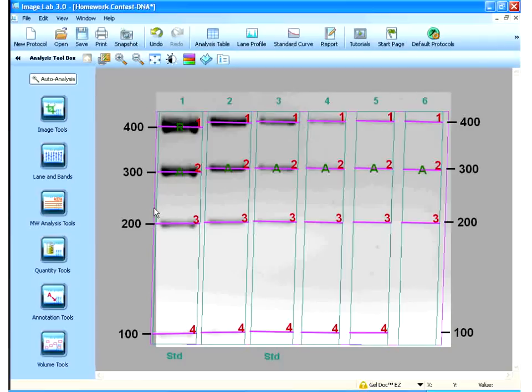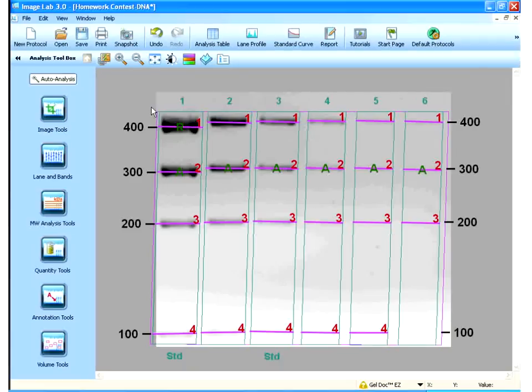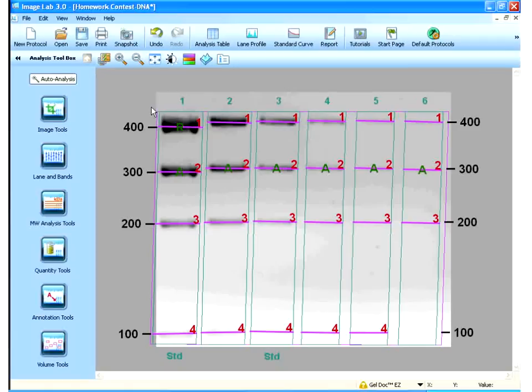So, I hope that was useful. Also, a very nice set of tools in Image Lab to allow you to do all the type of densitometry work that you would ever need to do for either gels or Western blots. Using the Chemidoc XRS, our Versadoc instruments, the 5000 and the 4000. Also, allows you to work with the GelDoc XR Plus, the Chemidoc XRS Plus, along with the GelDoc EZ and the Pharos FX. So, I hope that you take advantage of using this software. It's an excellent package. And, you can download it and use it whenever you wish on both Macintosh and PC computers. Thank you.